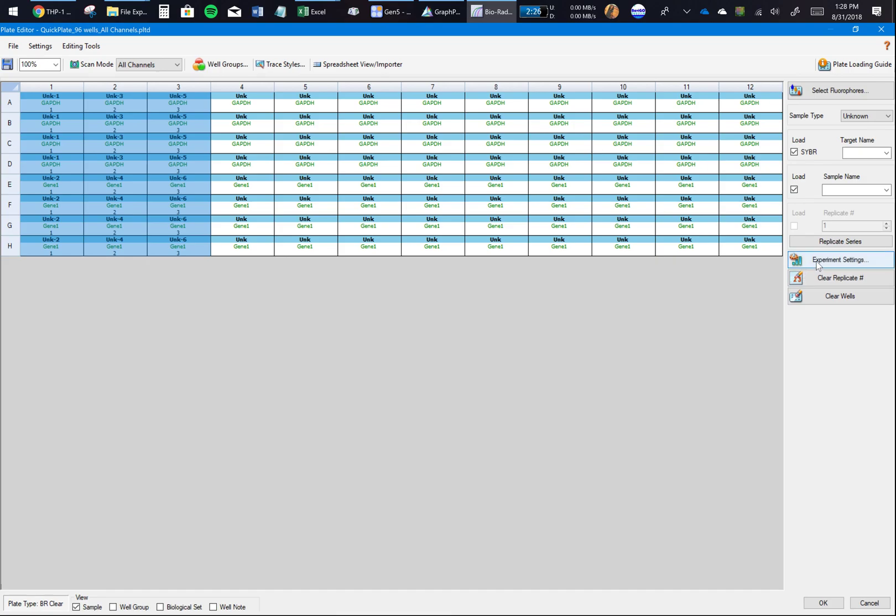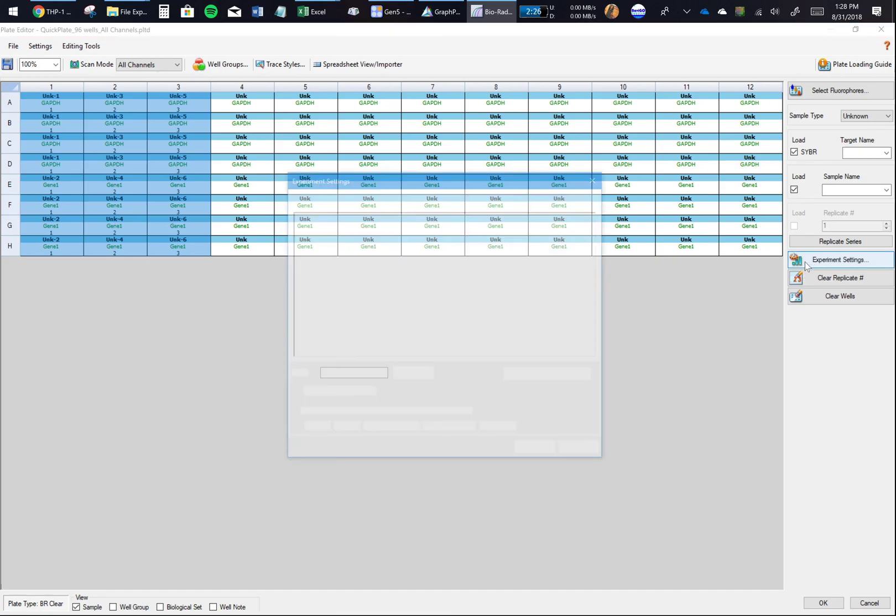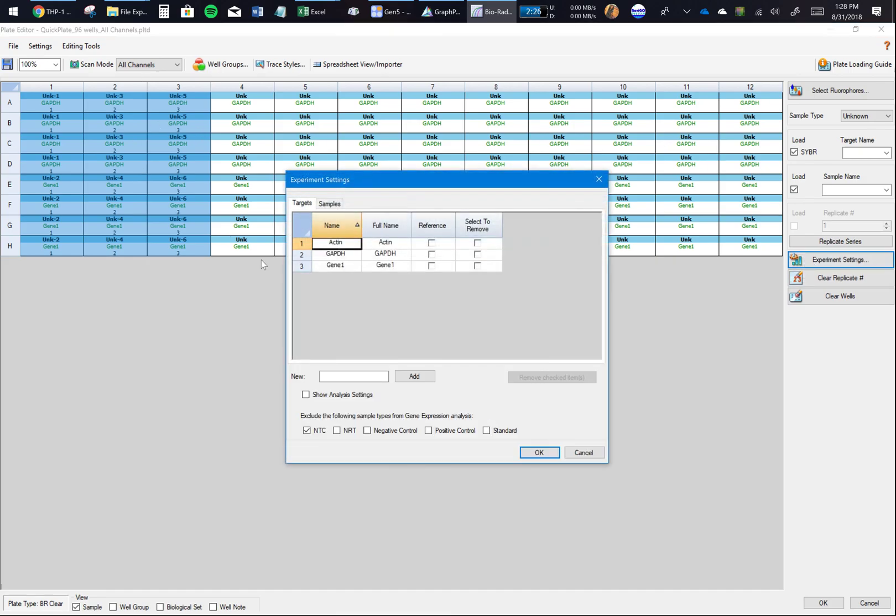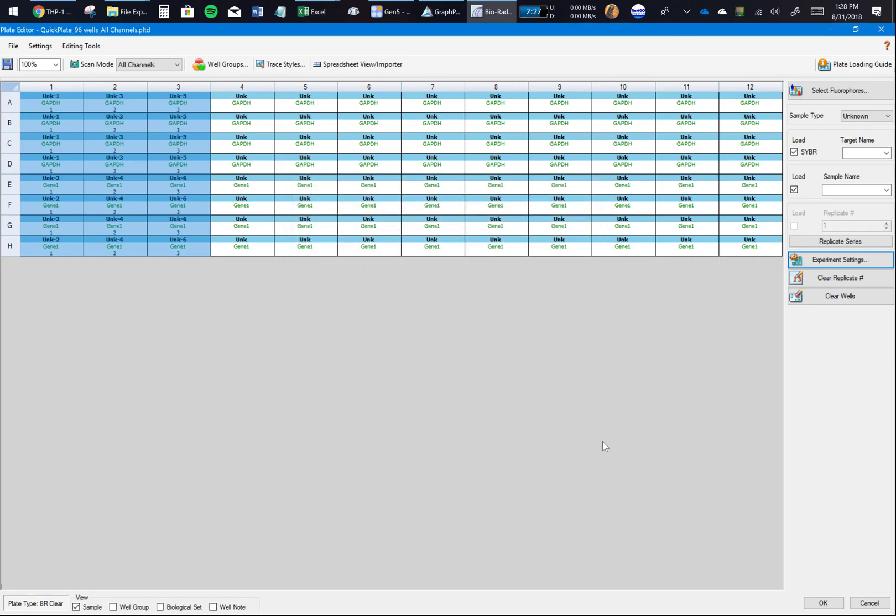I make sure they are in a pattern. If you see here, the four wells in one column are replicates, the next four are replicates. I'll go to Replicate Series. Since my replicates are arranged vertically and not horizontally, I'll click on Vertical.